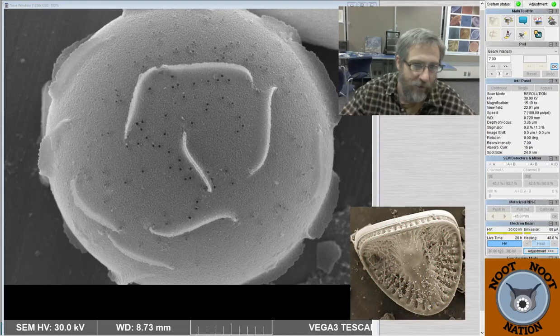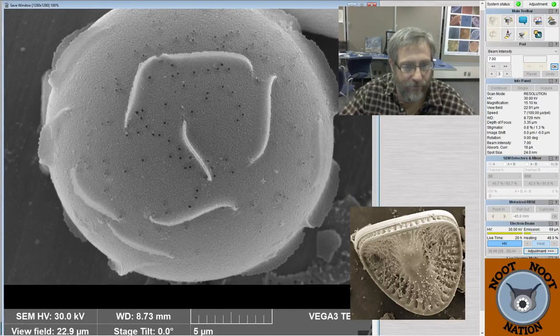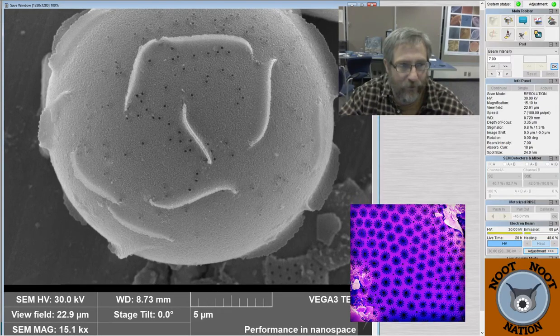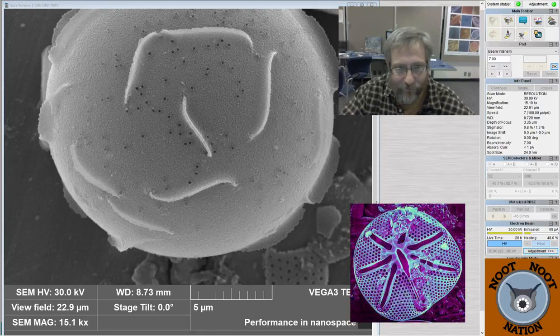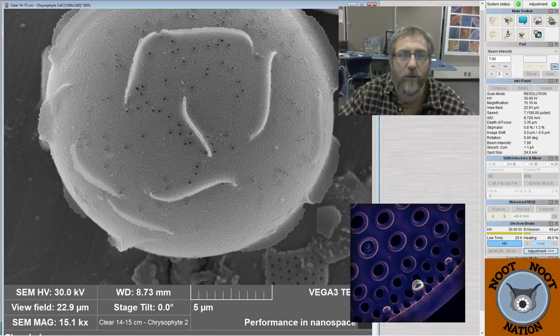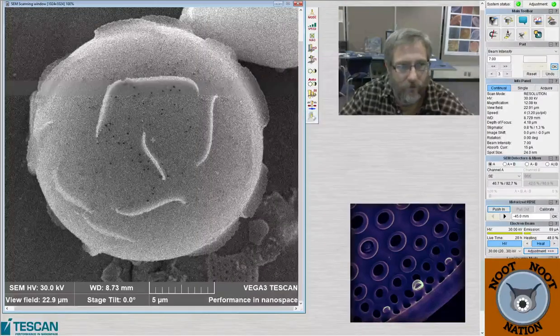They always have an aperture. For the one that we have in the field of view right now, I can't see an aperture, which means it's face down or around the bottom hemisphere and probably over here somewhere, but we can't see it. But I know it's a chrysophyte because I know chrysophytes often have these crazy fins on them. And it's otherwise spherical. So it's a good clue.